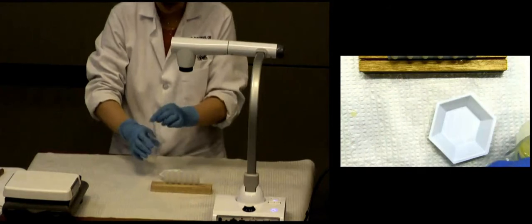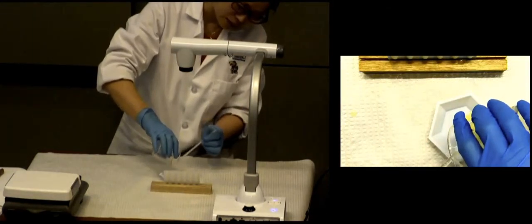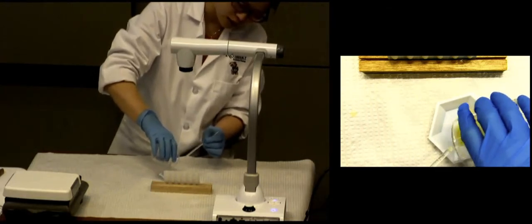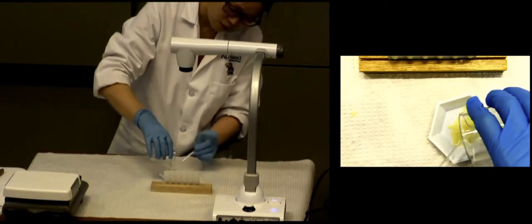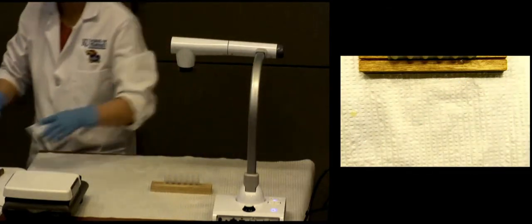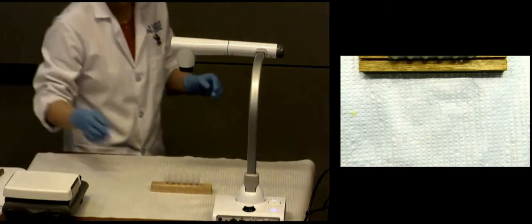What should I do with my excess? Remember, those are liquid right now, but when they congeal, they will become solid, and I don't want them to clog our sink. Therefore, I'm going to collect all my waste into a weigh boat, let it congeal there, and in the end, when it's solidified, then I can trash them in the regular trash. And you should do the same thing as well.